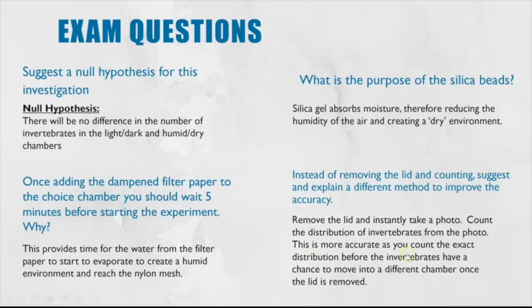And that is because the invertebrates won't have a chance to move around into a different chamber once the lid is removed. So you are getting the exact results from each of those chambers before the lid is taken off, and light can then go to all of the sections.